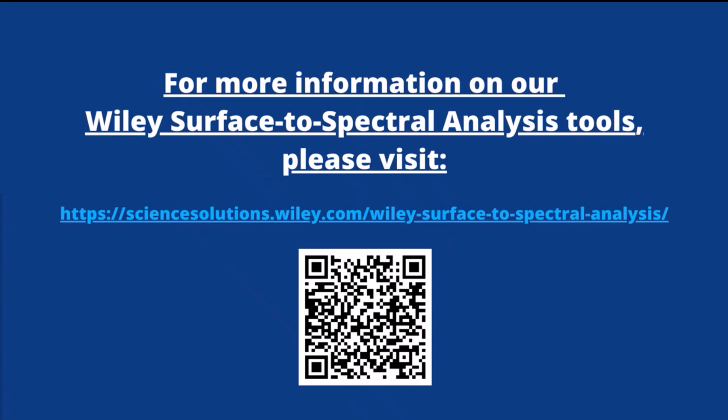We have a little bit more time here. Let's see. How, and this is a pretty specific question, how is this applicable for botanical materials? The exact sample type shouldn't matter. If you are hoping to search a spectrum against our spectral libraries within KnowItAll, that's where it would come into play, depending on which spectral libraries you have access to and what is in those spectral libraries.